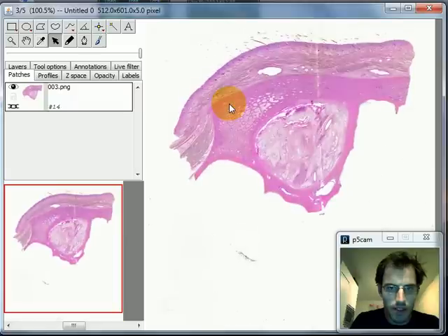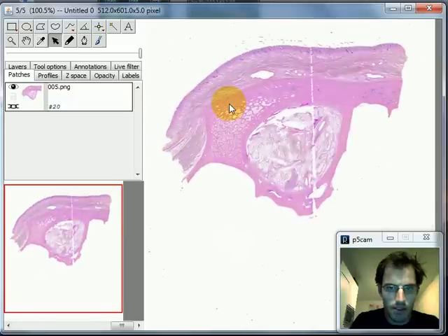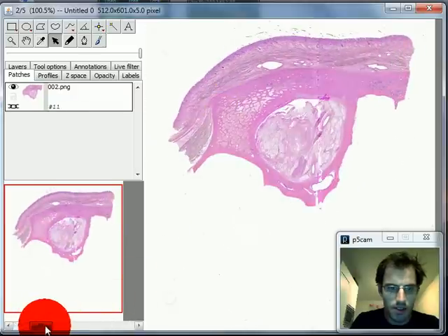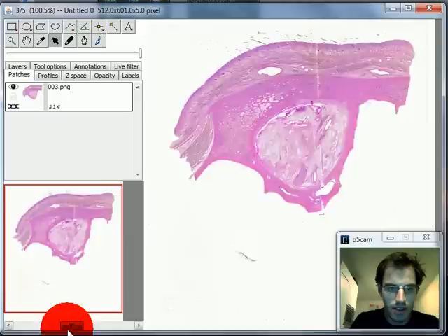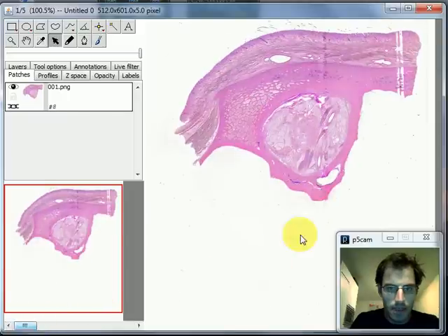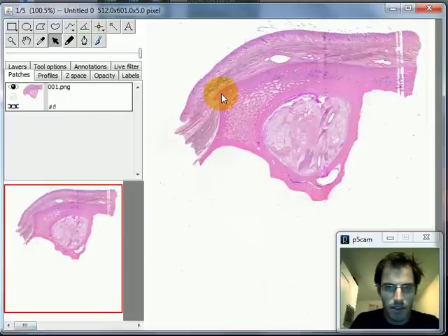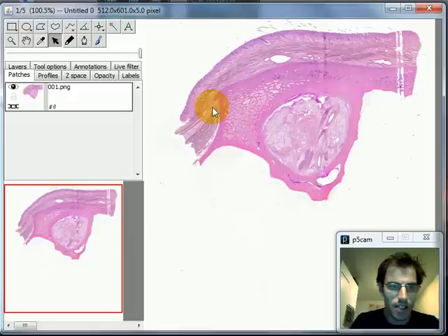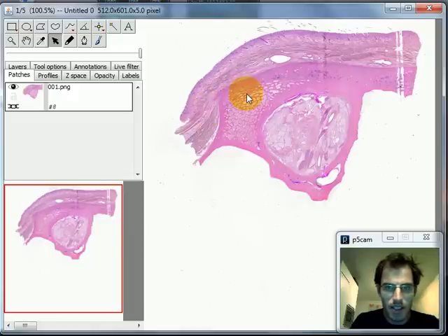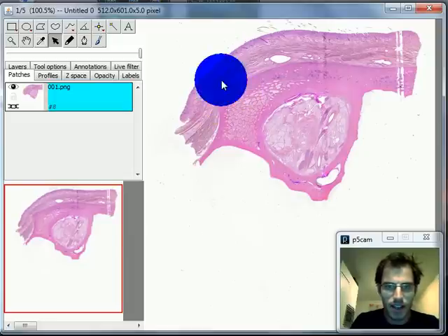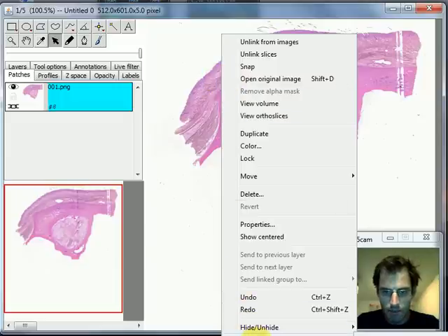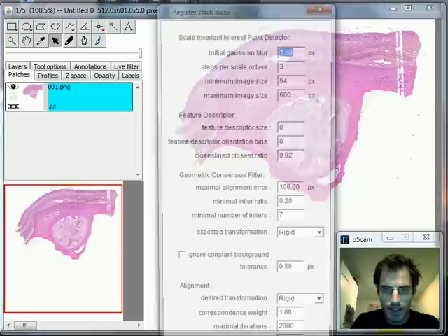Okay so by using the mouse wheel I can scroll through my stack. I can also make use of the slider down here. And now I just want to use a feature-based alignment or registration algorithm. So what I do is I left-click on the image to select it, then I right-click. And then I select from the pop-up menu, I select Align, and then Align Stack Slices.